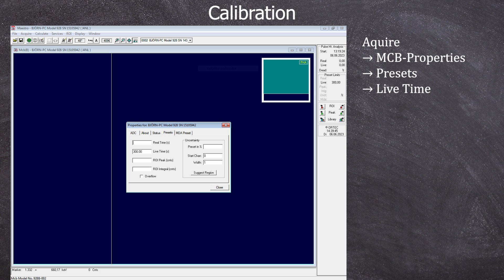A quick note on the key assignments: you can zoom into the spectrum with F8 and zoom out of it with F7. Using the up arrow key increases the channel or marker resolution and using the down arrow key decreases it.